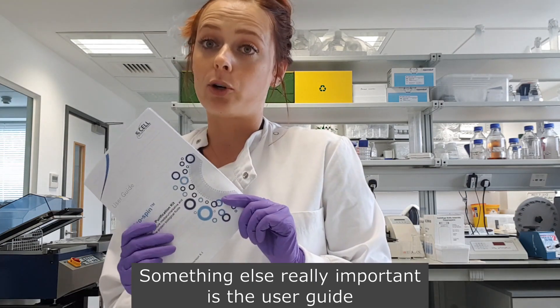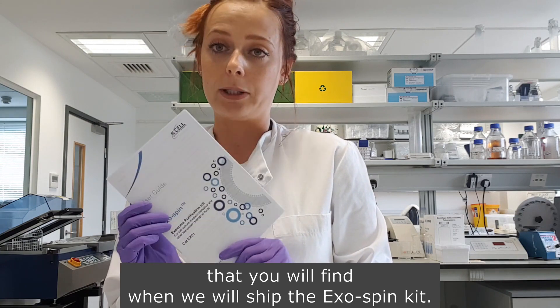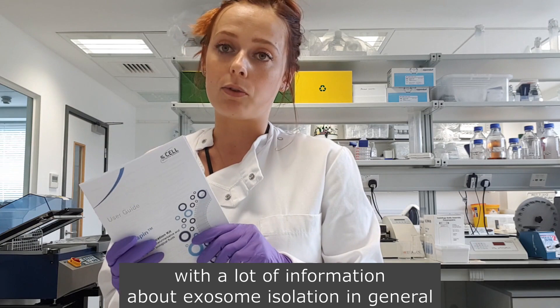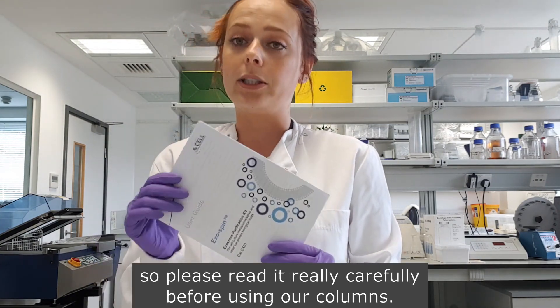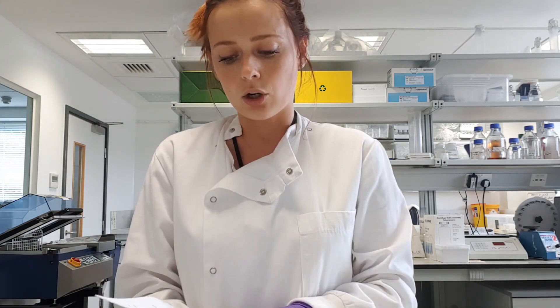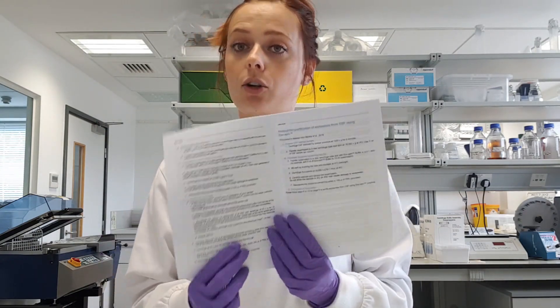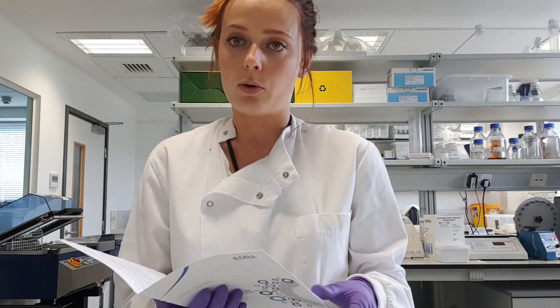Something really important is the user guide that you will find when we ship the Exospin kits. It's a really valuable document with a lot of information about exosome isolation in general, and more importantly about our kits, so please read it carefully before using our columns. Today I'm going to show you the step on page 6 — you can follow along with the user guide, or download it on our website.